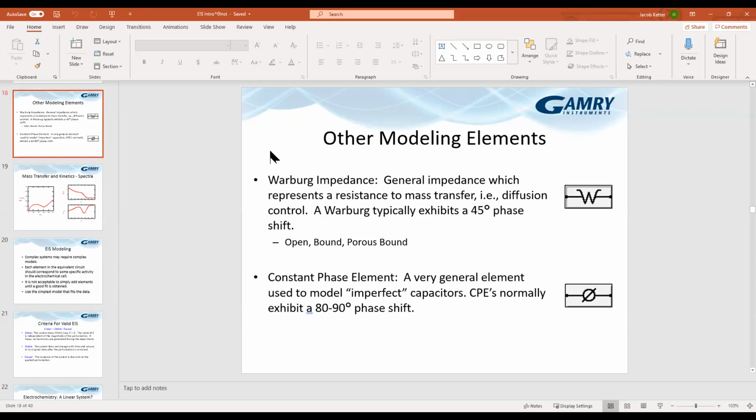If you short between the terminals, and there's ways to do that accidentally, I don't necessarily mean dropping a wrench between two terminals to short across them. So the easiest way in terms of our systems is knowing where ground is. And for us, ground is on the working side of the potentiostat internally. It's a virtual ground if you're floating, it's earth ground if you're not, but it's on the working side. And there is a black ground lead.